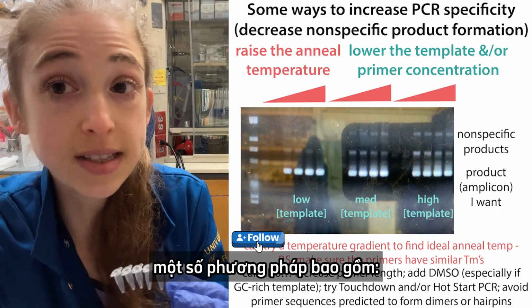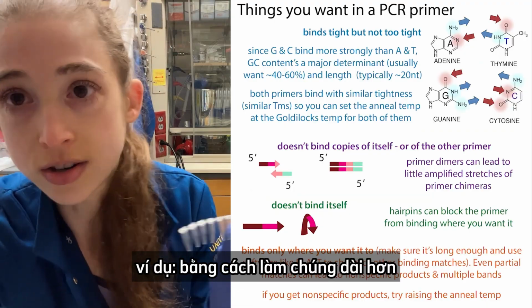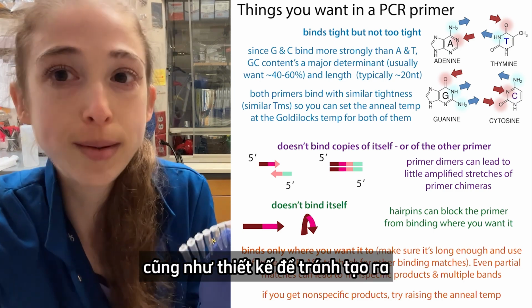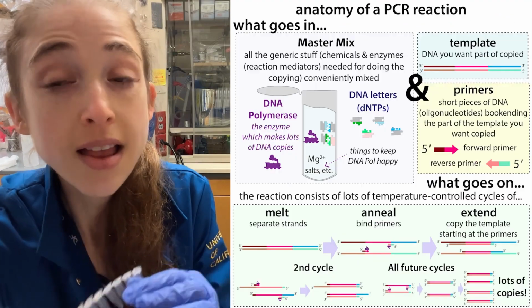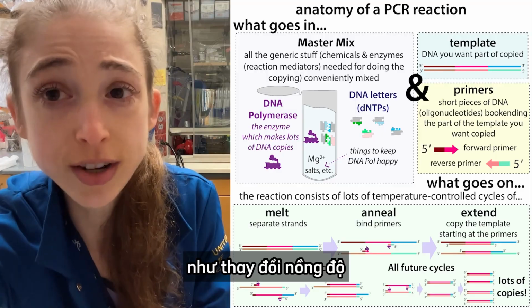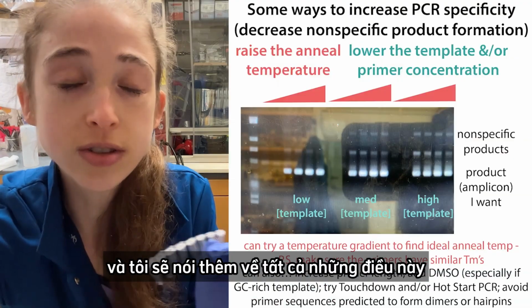Some of these methods include redesigning your primers to make them more specific, such as by making them longer so they're less likely to bind to other sites, as well as avoiding primer dimers and structures forming. Other things involve making changes just to the PCR reaction conditions, such as changing concentrations, or, most commonly where I start, changing the annealing temperature. I'll tell you more about all of these.